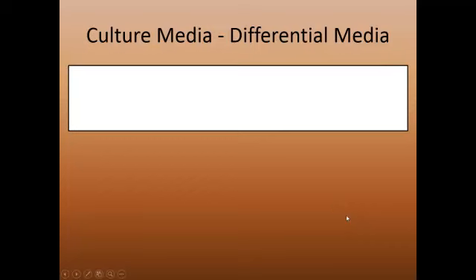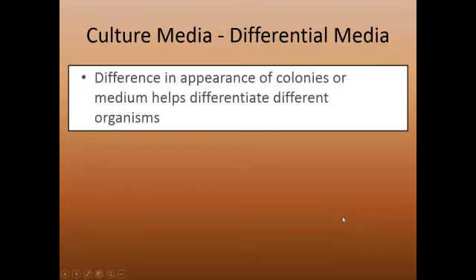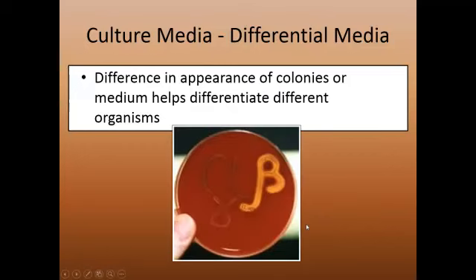Differential media, on the other hand, is media that helps tell the difference between different organisms depending upon the appearance of the colonies or the medium. So here's an example of a differential media you will be using in lab.